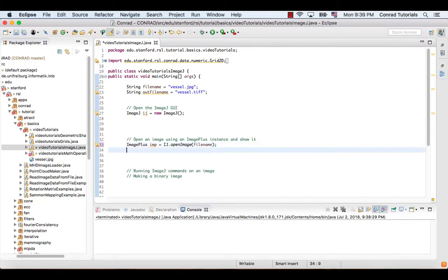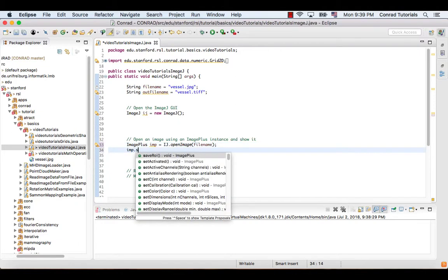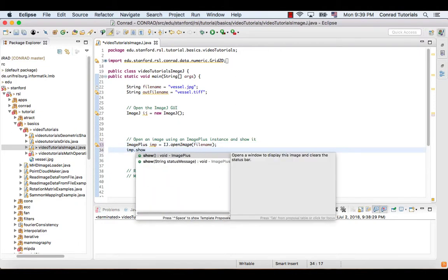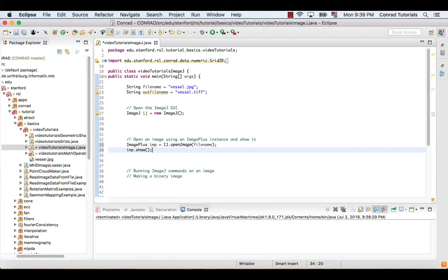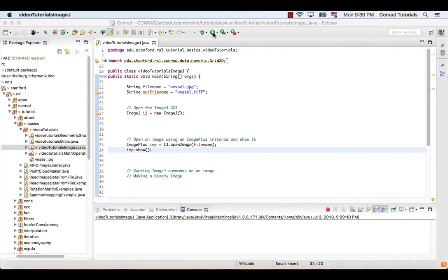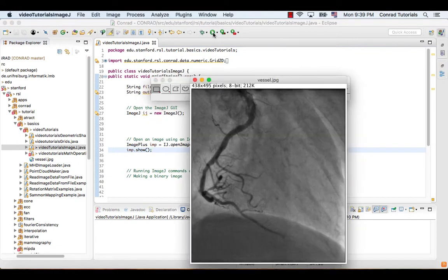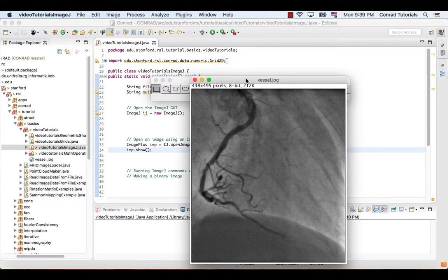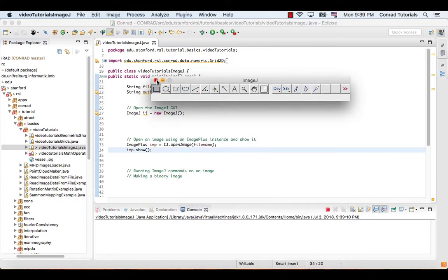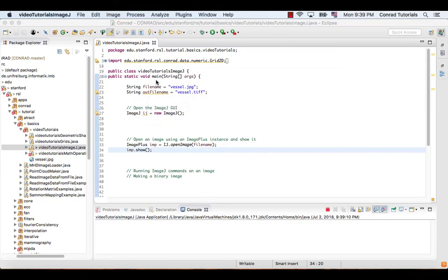You can also display the opened image as shown in the code.